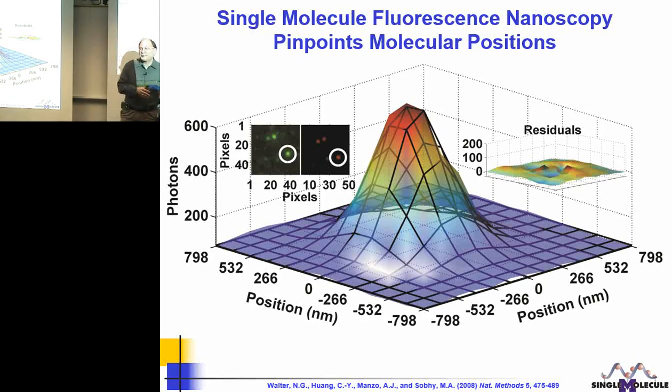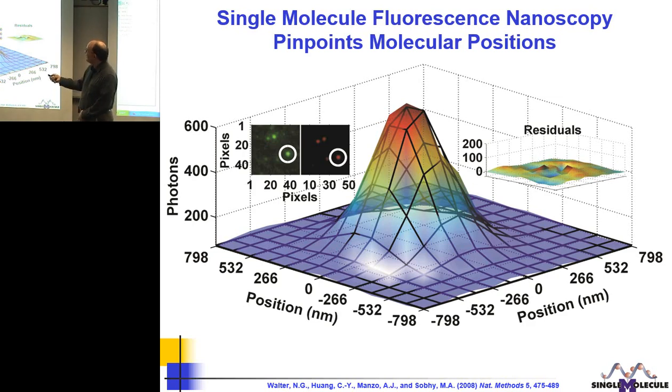Now, derived from this was another aspect, sometimes referred to as nanoscopy, breaking the diffraction limit towards the nanometer scale of microscopy. In principle, it works as follows: you have an observation of, say, a green and a red fluorophore in a field of view. Because we have a pixelated camera that detects this, the center pixel will get the most light. This light distribution is called a point spread function, in which the center pixel gets the most, and further outlying pixels get less and less light. The width of this distribution is about half the wavelength of light, the classical resolution limit of optical microscopy.